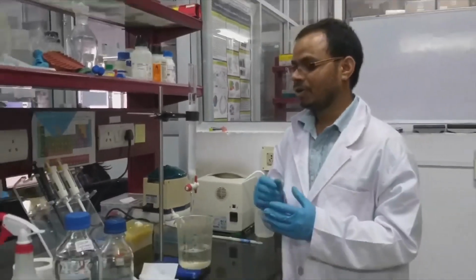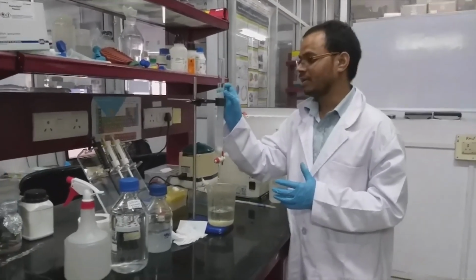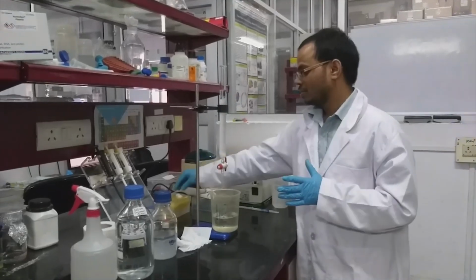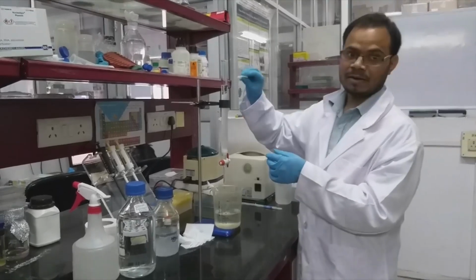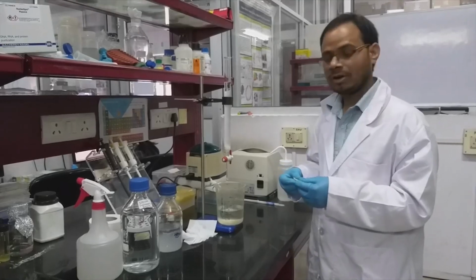Before loading the sample, we have to remember that we cannot directly load the sample as it will disturb the column packing. So what we have to do is put a small piece of paper on top of the beads. So on top of that we can load our sample.